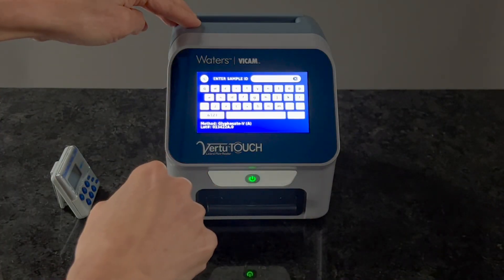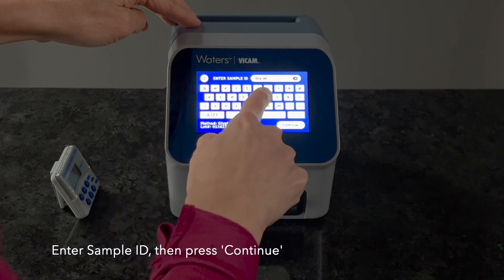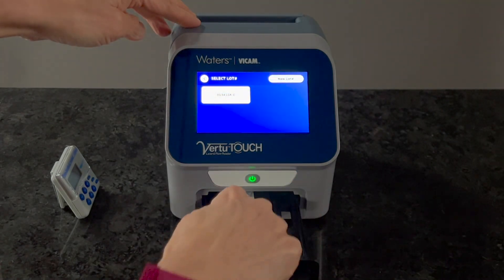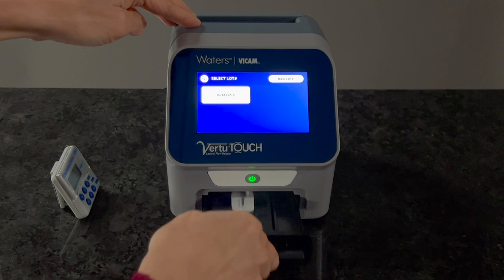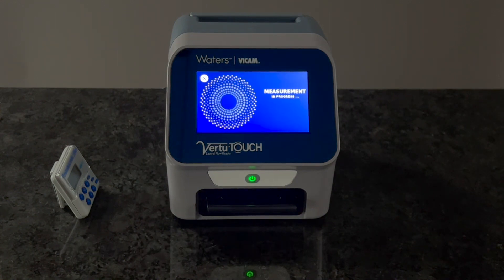Select the glyphosate method from the VirtuTouch Reader menu, entering a sample ID when prompted. Open the VirtuTouch Reader sample drawer, placing the glyphosate V strip into the drawer with the circular sample opening facing towards the reader. Then close the drawer and press continue to analyze the test strip. Numeric results will appear on the screen.